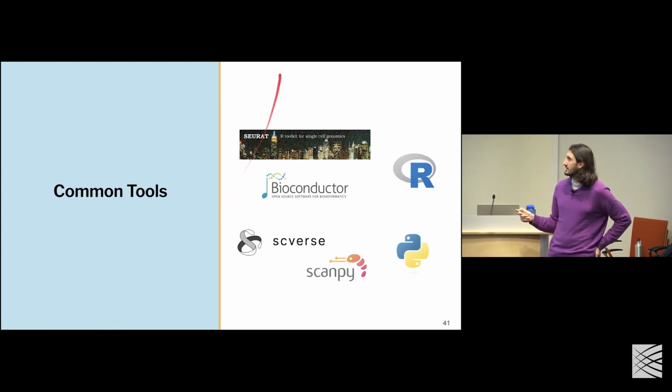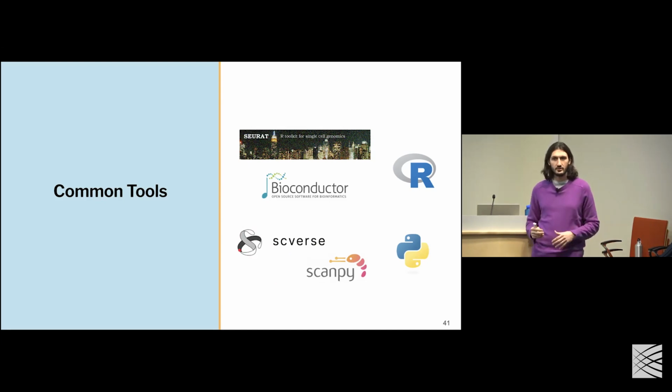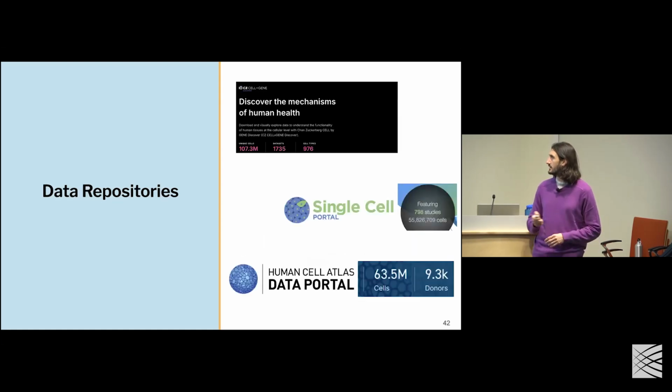Tools to analyze the data in R, Seurat and Bioconductor are the two big players. In Python, it's Scanpy, which is part of the scverse family, which is trying to do this Bioconductor family of suite of packages for Python, which I think is very cool.